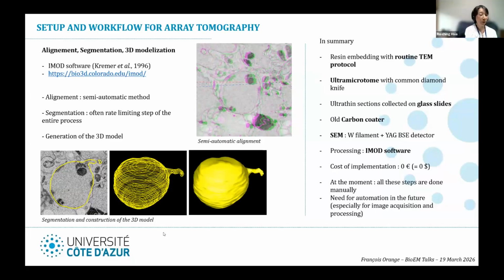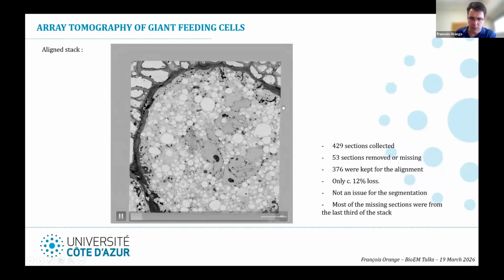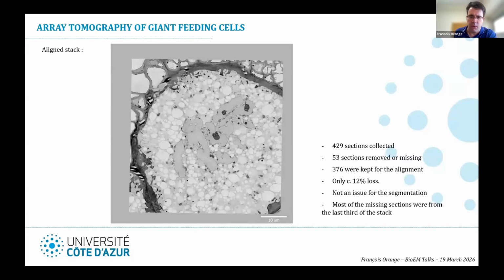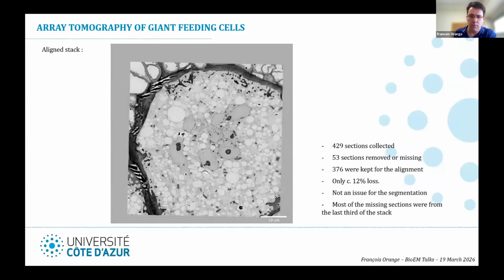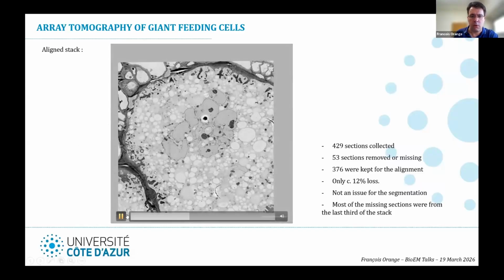Good to know. Yeah, so Steph asked a question about the nuclear tubes. Are they found in which stage of the nematodes, adult or larvae? She would also like to know if they are in plant cells. They are in the plant cells. All the things that I've shown to you are in the plants. The nematode is not here. You can see this is a giant cell from the plants which has been produced as a result of the presence of the nematode, but this is a plant cell, and so the nuclear tube will happen with this nucleus there.